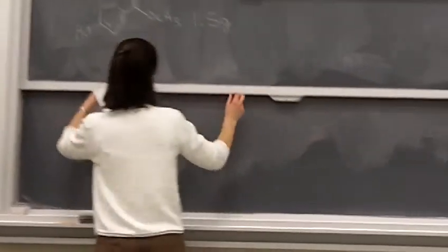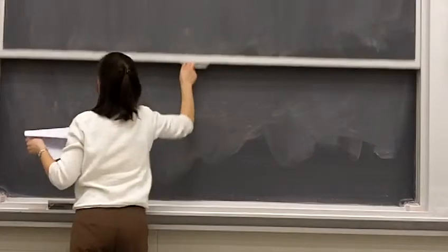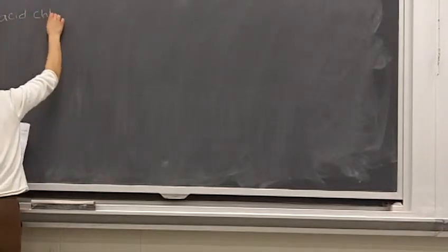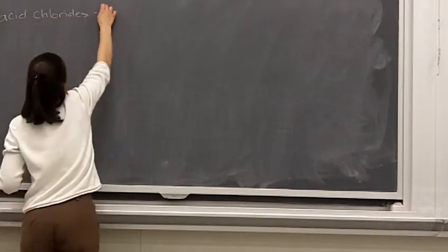Now, with what we are going to use this week, we've got to consider some hazards and precautions that we need to take into account. So the acid chlorides are lachrymators.